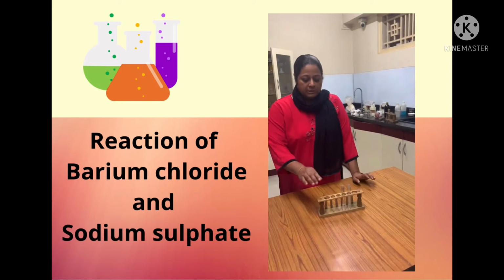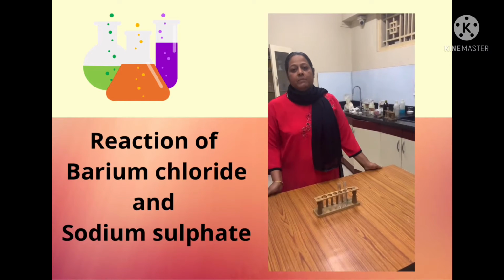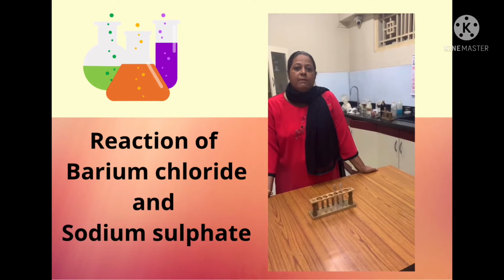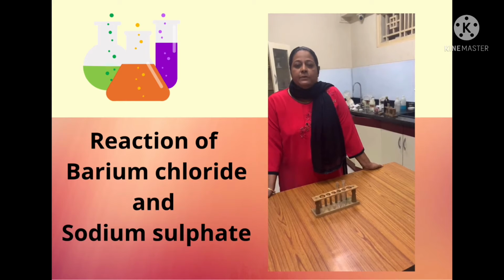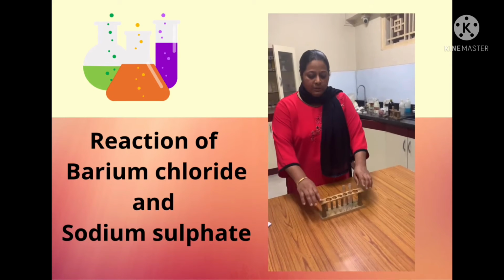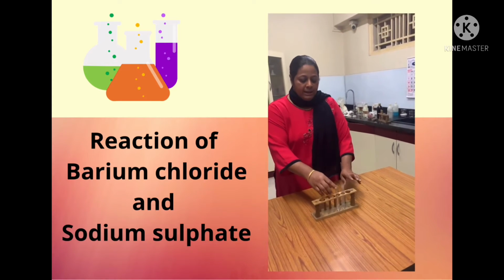I have got a test tube holder over here, right? The aim of the experiment is the reaction between barium chloride and sodium sulphate solution. We'll see what outcome we get after these two chemicals react with each other. So at present we have got a test tube holder. There are two test tubes, as you can see.